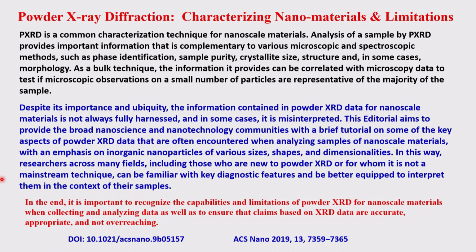So that is why this paper has been brought to the students, researchers, various people who should exercise caution while explaining the powder XRD. Some features you may explain as one thing, but they may be something different. For example, the width is not necessarily the size of the particle, but it can also be the instrumental parameters, and many other kinds of parameters are also possible.